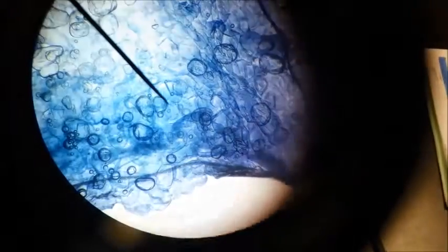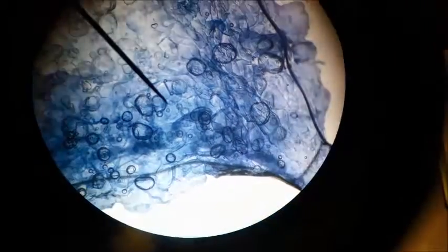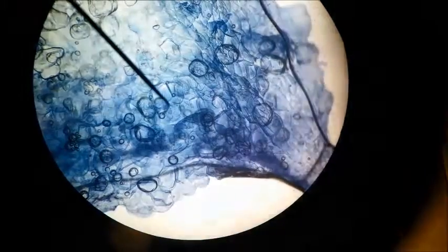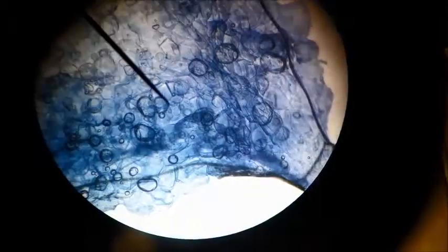This is the onion pith stained with Janus Green. When I'm looking around this slide it just looks like a big pile of ice cubes — it's actually beautiful. You can see some nuclei when you look around a little bit.